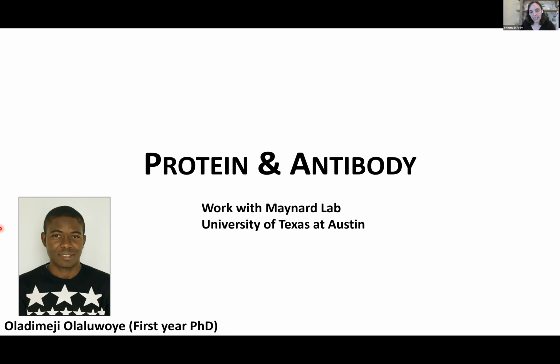And I want to point out this was done very, very quickly by a first-year student in my lab. The reason I want to point that out is because often professors are worried that it's going to take students a long time to learn how to do an HDX experiment. This student had no prior experience with HDX or mass spectrometry, and I think in the space of about 4 to 5 months was able to produce this really, really nice data.